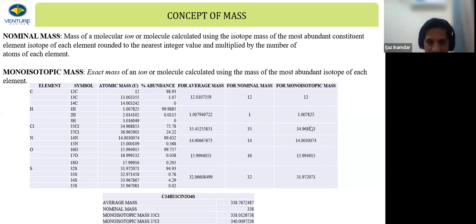So I will take this. Okay. Now, interesting cases, if you understand this, this is good. You see the abundance part here. In chlorine, the abundance is pretty high for the other isotope, 25%. Here it is only 1% and 2%. So in chlorine, the abundance is very high.